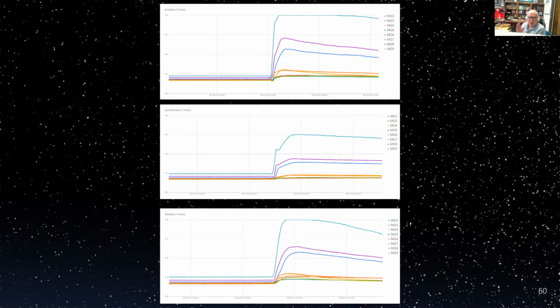Despite this, we were still able to have successful classification. Hunter, why don't you explain what saturation is to members of the audience who may not know? Okay, so to the MOS sensors, because of the oxide and how it interacts with oxygen and our chemicals, complete saturation here would mean that the reducing gas is blocking all oxygen to our sensing element, increasing electron flow to the maximum. And then as this diffuses and oxygen is able to be reintroduced and bind with the sensing element, we decrease our signal as electron flow is slowed due to the oxygen. I hope I answered that sufficiently.